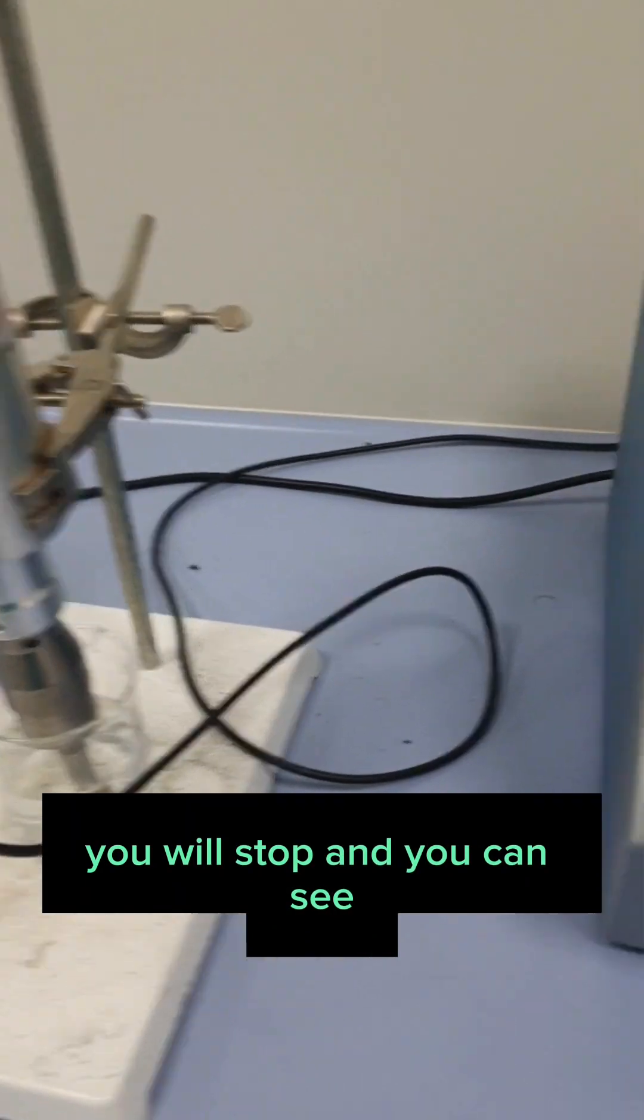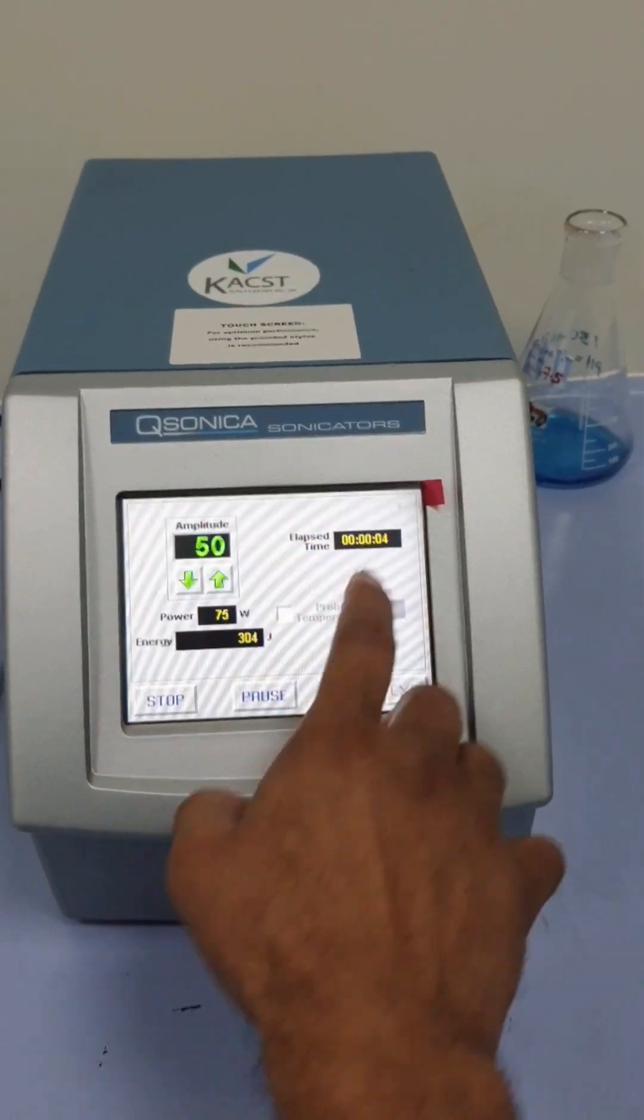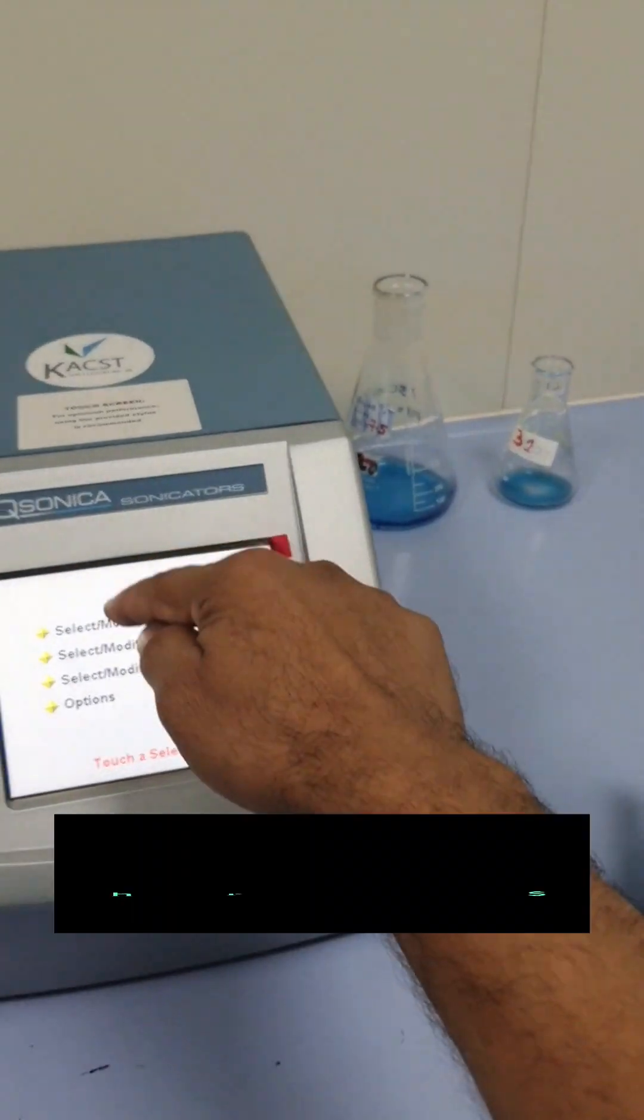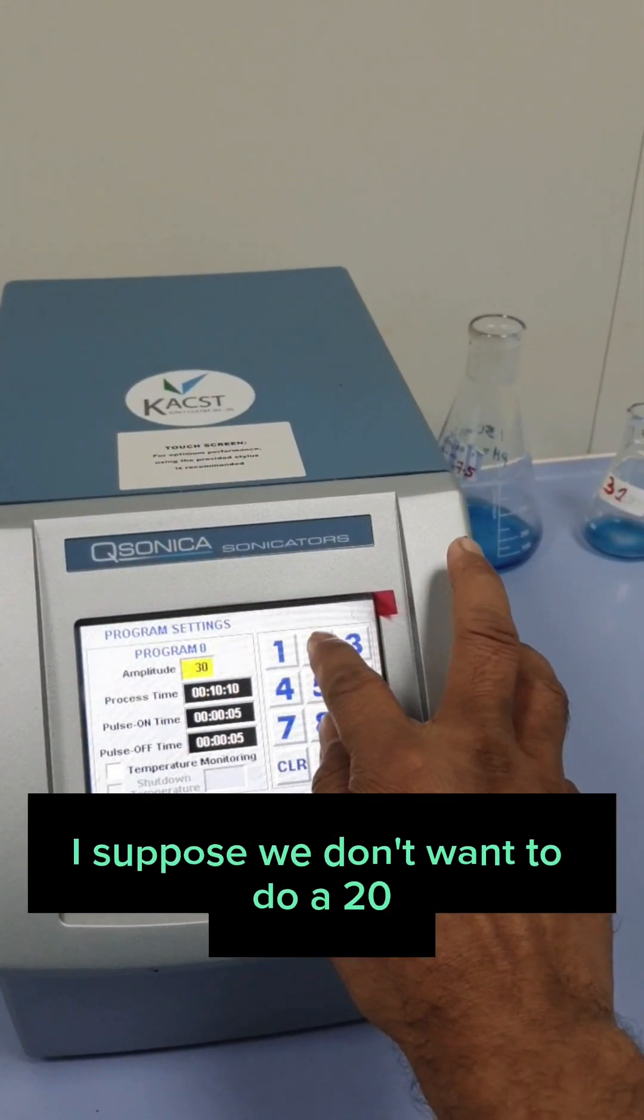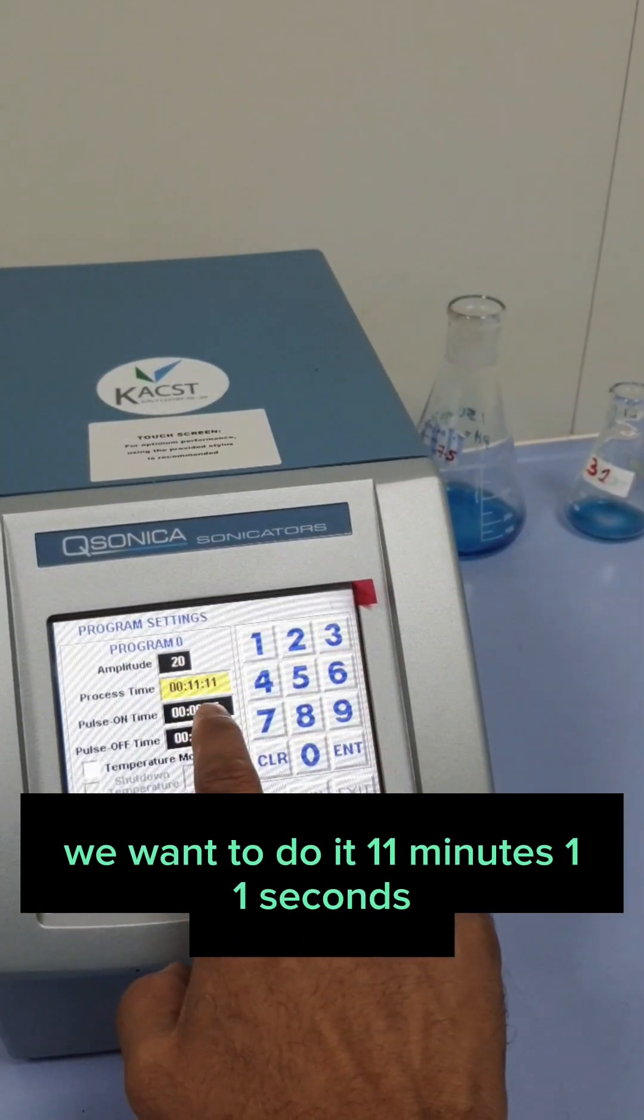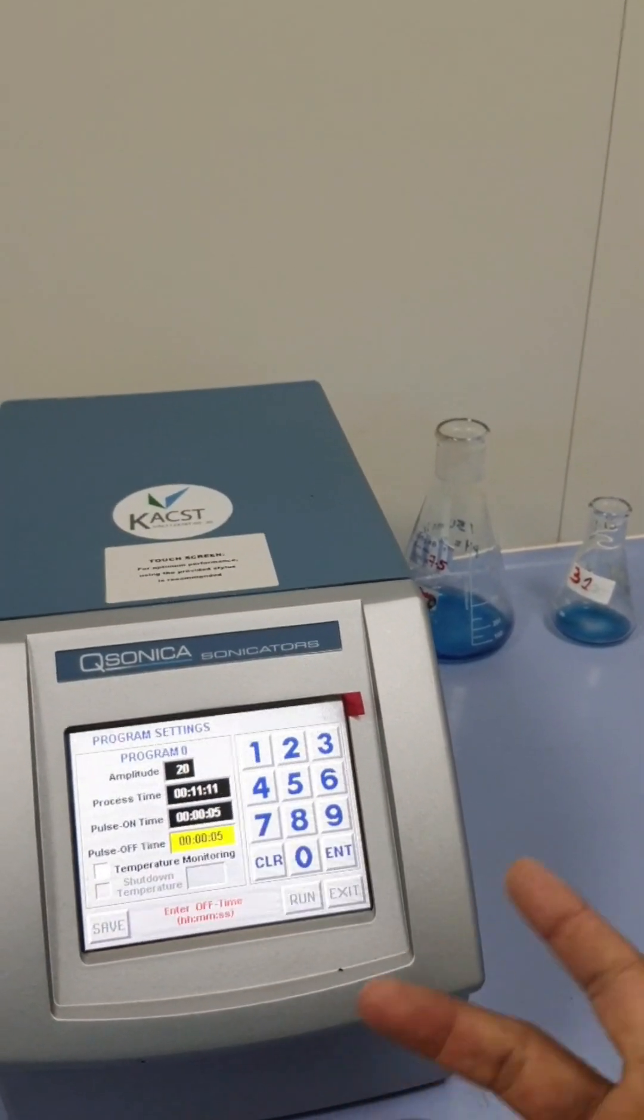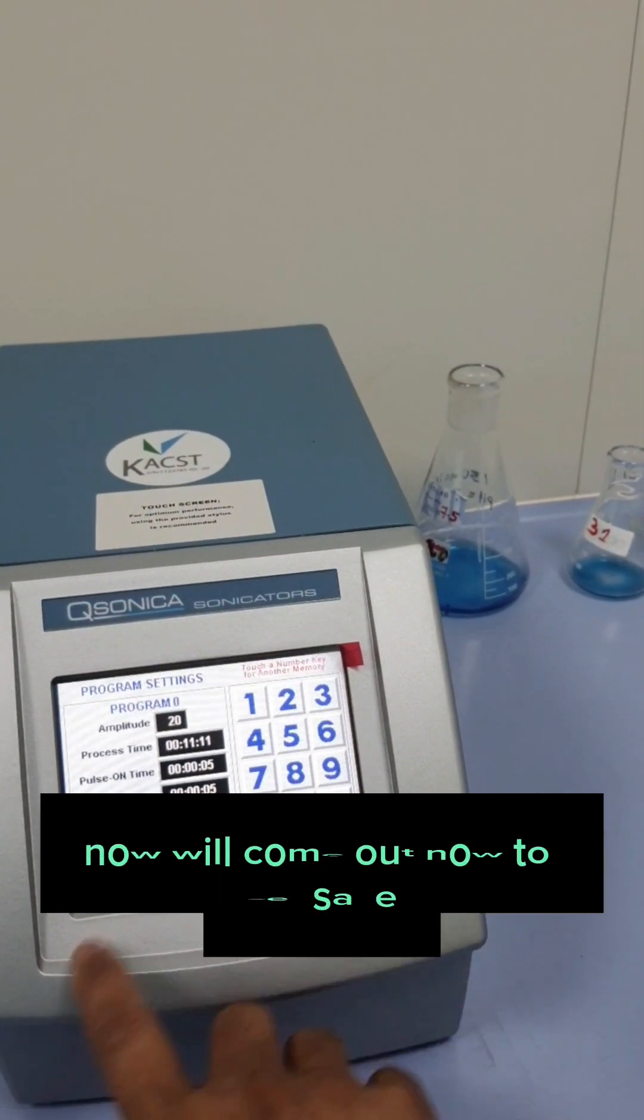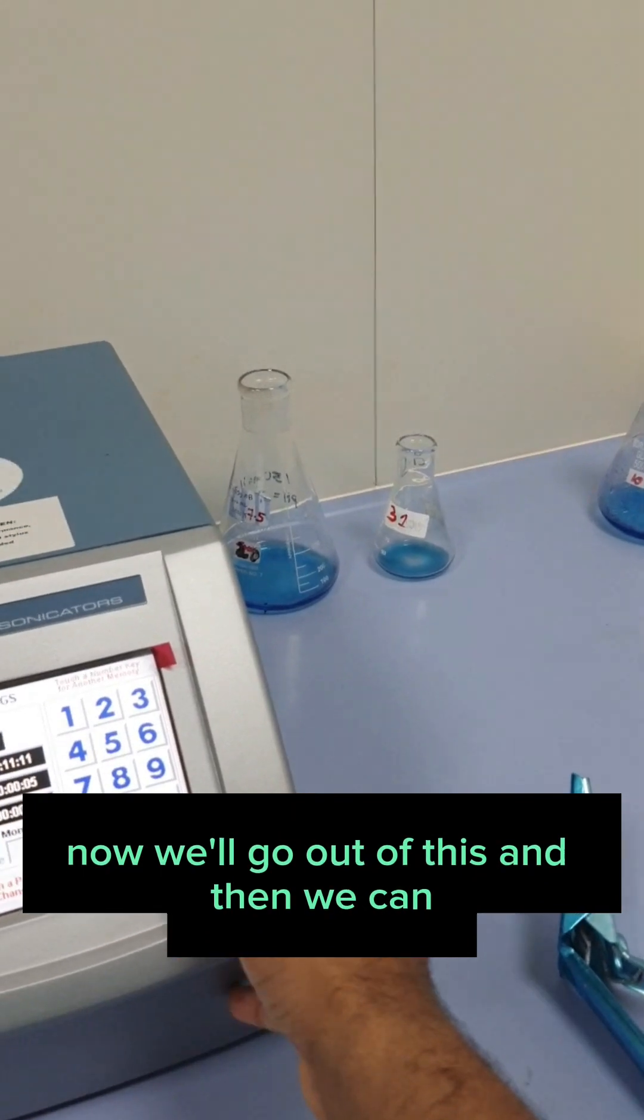Now you will stop. And you can see. And then exit. We will go to the other options. There are a lot of options. Select or modify a program. We can modify it. We can change the amplitude. Let's suppose we don't want to do 20. And what is the time? Suppose we want to do 11 minutes, 11 seconds. Pulse on, pulse off. We already saw these kind of settings in our old videos. In case when I was preparing LDH, layered double hydroxides. Pulse on, pulse off. We will come out. We say save. And then run. We can start. Now we will go out of this.